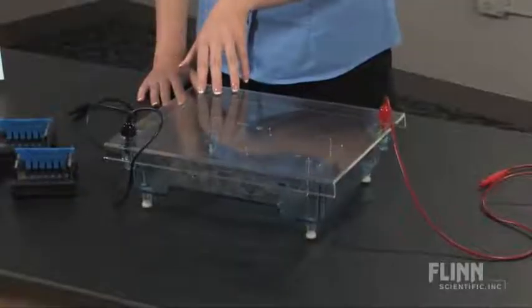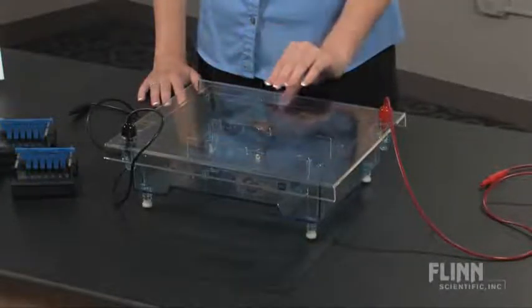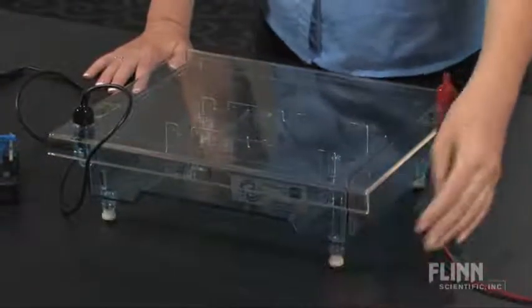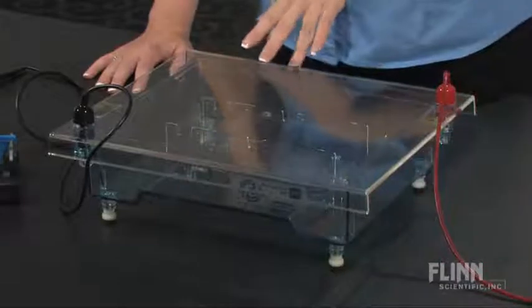It has a transparent cover to prevent shocks as well as protect the delicate agarose gels. It has adjustable feet in order to ensure that fluid levels stay uniform and produce accurate results.